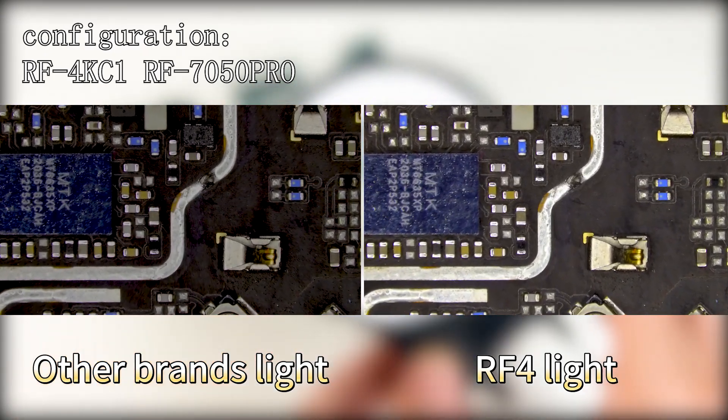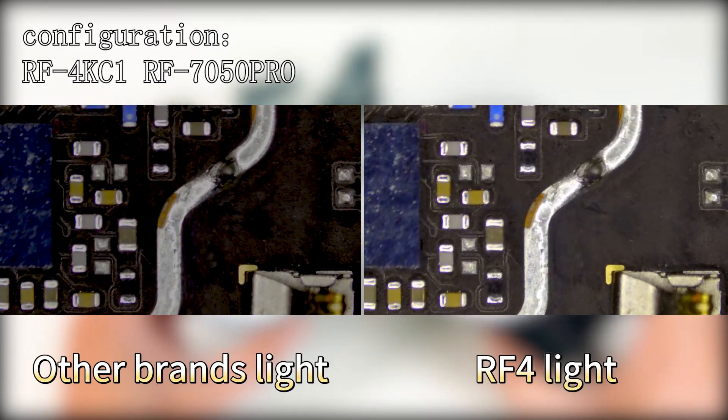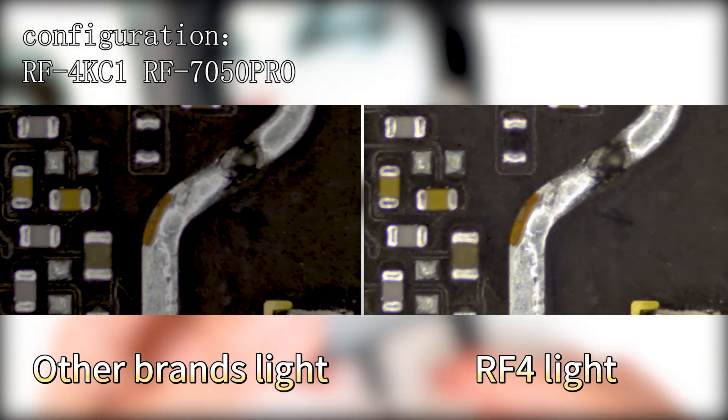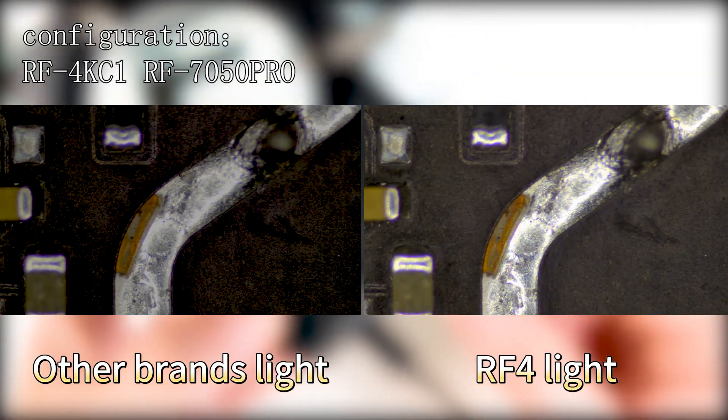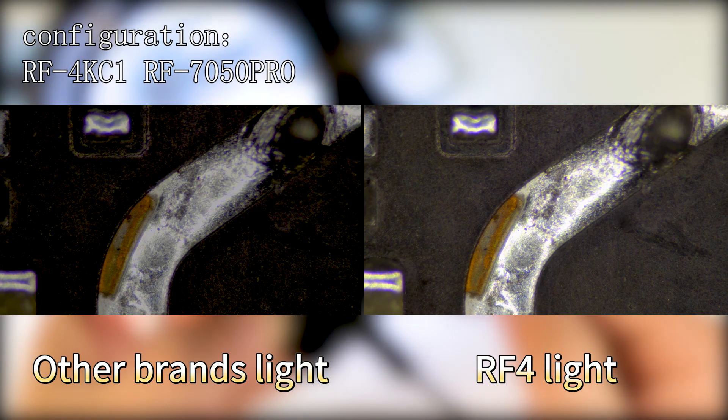Imagine that when you turn on the microscope, the 144 lamp beads of RF4 light up at the same time, reflecting the magical world of cells. Each lamp bead emits a powerful light, making your observation clearer and more detailed — no omission, no blur, only absolute brightness and uniform lighting effect.